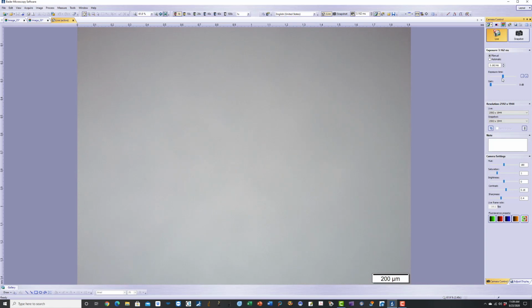So this is a large area thin section of 50 millimeter by 75 millimeter size, 2 inch by 3 inch size thin section, where I have a portion of the slate paver from both sides and a central jointing mortar. I'll show you. And the sample is impregnated with a blue fluorescent dye.